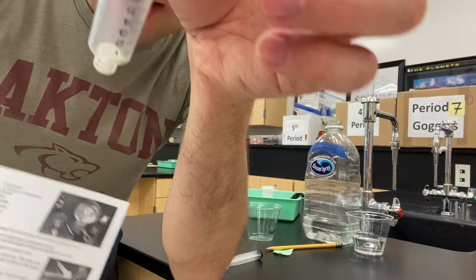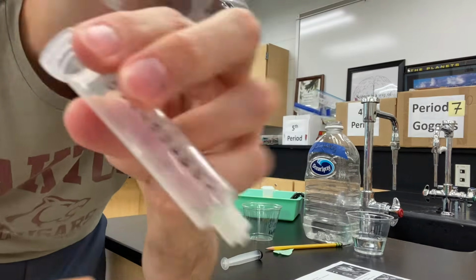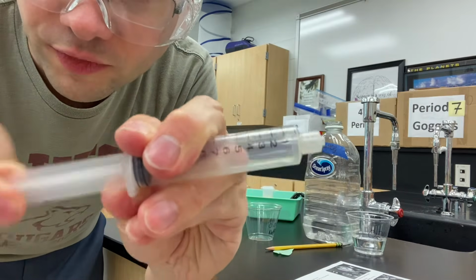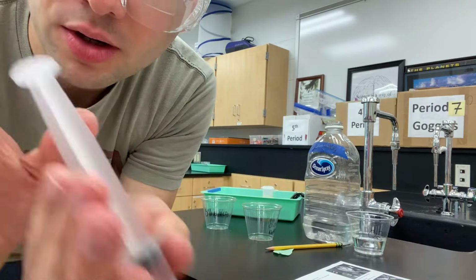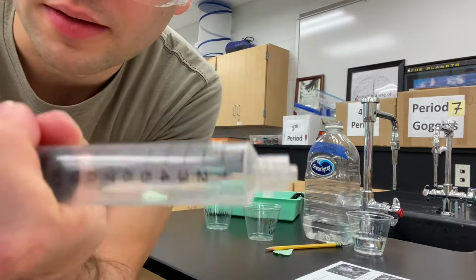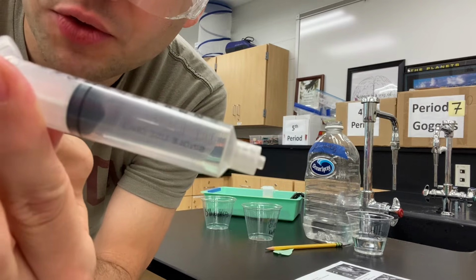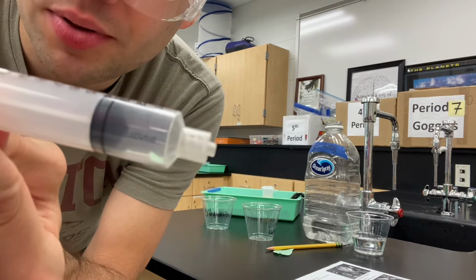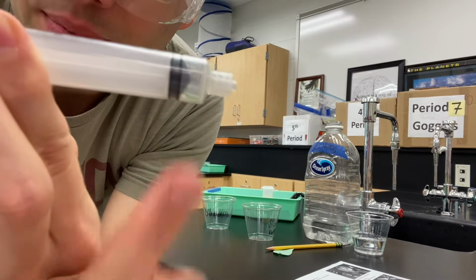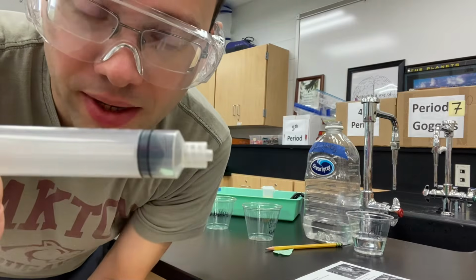So you can kind of see my 1 little disc that I've done. You're gonna have 10 in here. But then you're gonna take your stopper for the syringe and push the syringe all the way up until about here. You're gonna leave a little gap here because you don't wanna crush the leaves. So you're gonna have a little air pocket.